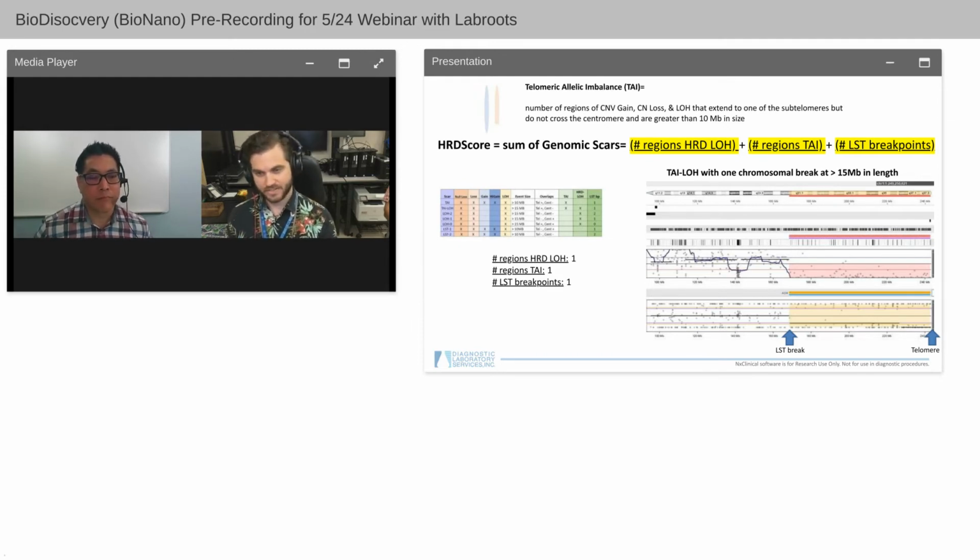I add that that's here, and that's helpful because it does train your eyes to understand. You can have the software help you color code that. It's frankly a great way to learn. And sorry for the tangent.